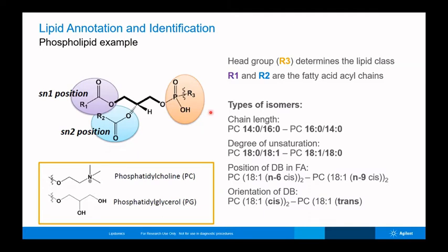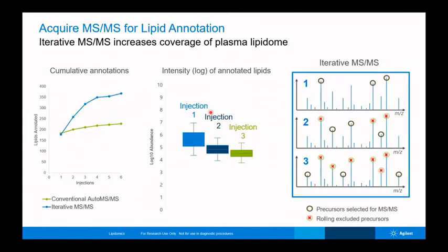So in order to get the maximum amount of information in a particular sample, when we are trying to annotate and perform MS/MS or data dependent analysis, usually these software tools, a comprehensive data dependent LC/MS analysis, give you high quality MS/MS data, but it's linked to how many ions you get in an injection. Usually we program it to do n number of compounds. So in order to get more information, this is where in the acquisition we've got the solution with iterative MS/MS, where you are automatically creating an exclusion list and injecting the sample more than once and looking more in depth at the data.